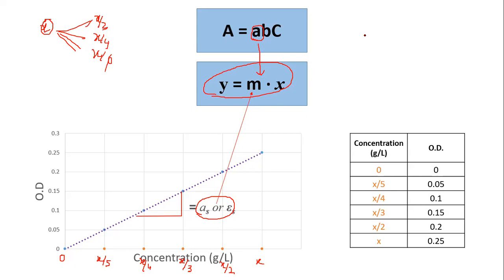Now comes the most important point. This is called the concept of blank or reference that we actually use before we start doing these kind of absorbance recordings, right? So what is a blank? Can anybody tell me what is a blank?